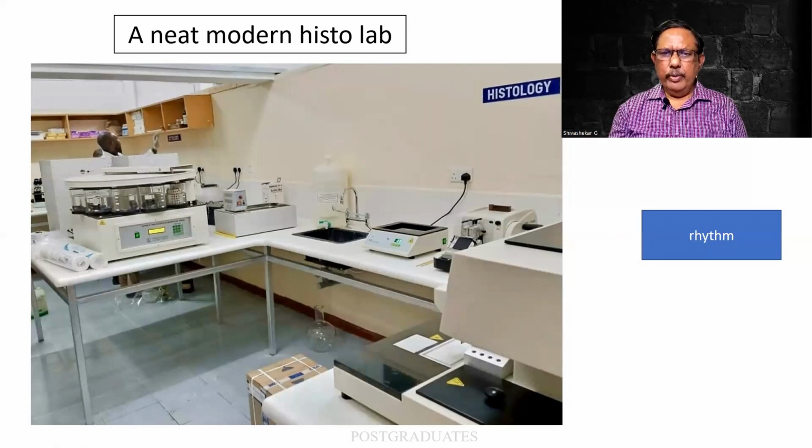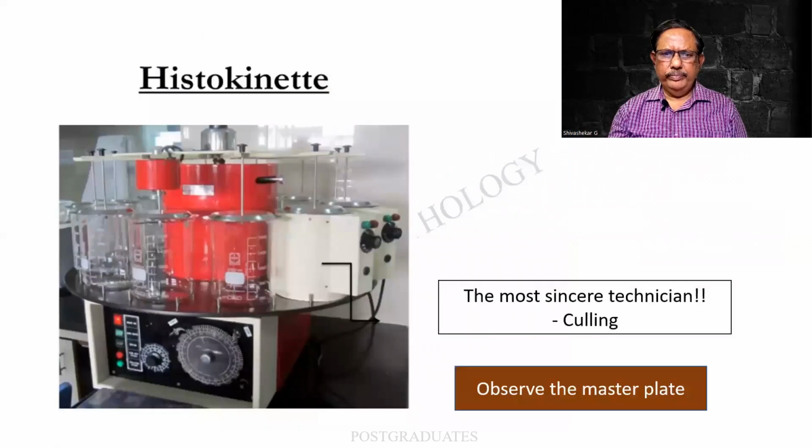So this is a beautiful one. The instrument that we are seeing on the screen is the histokinette. And Culling, the great author of histotechnology, has defined this as the most sincere technician. Why, we shall see.